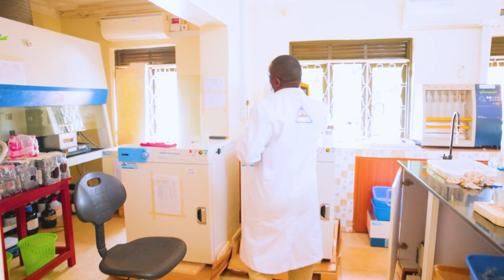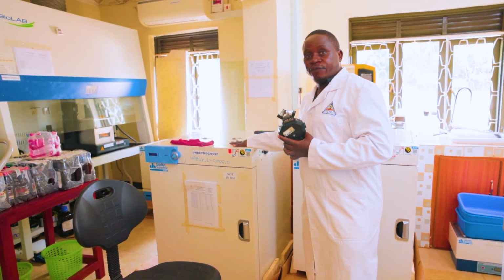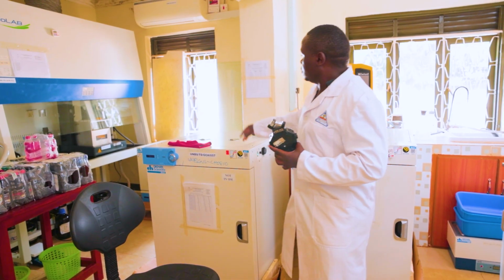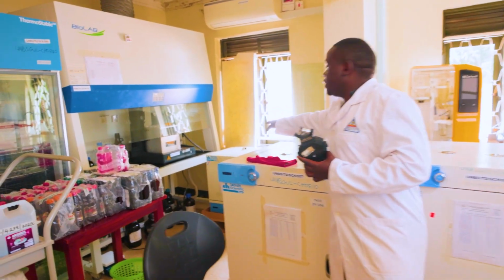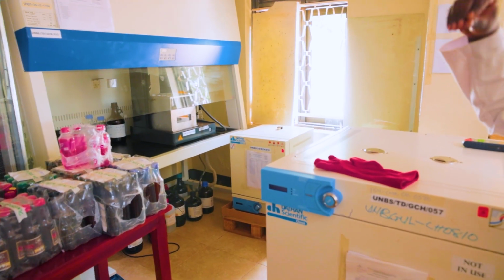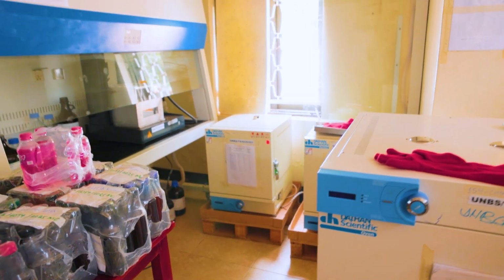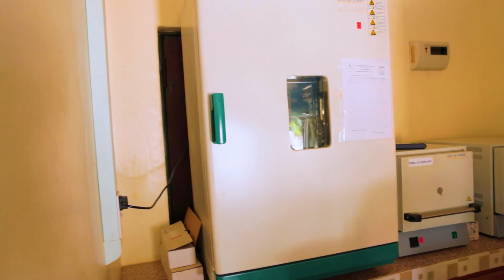The moisture in the different foods, we do it here. This is an oven for moisture determination. We have furnaces. We have 4 furnaces for ash and acid insoluble ash in foods, things like that. The ovens, you have these 2, and then these other ones. That one and the other one.